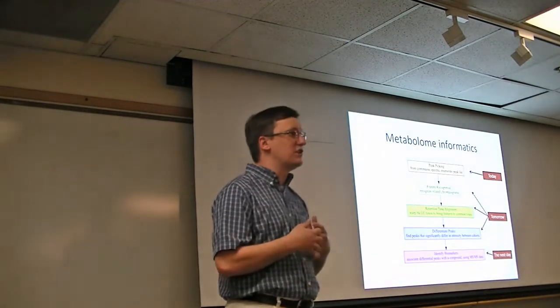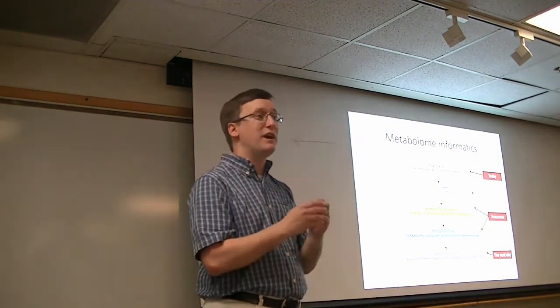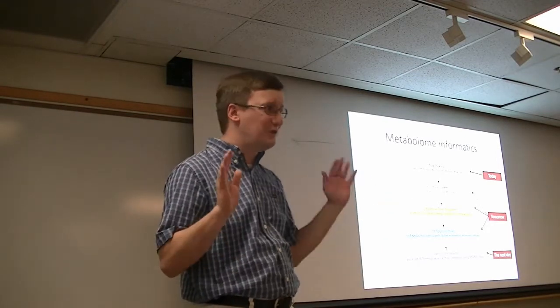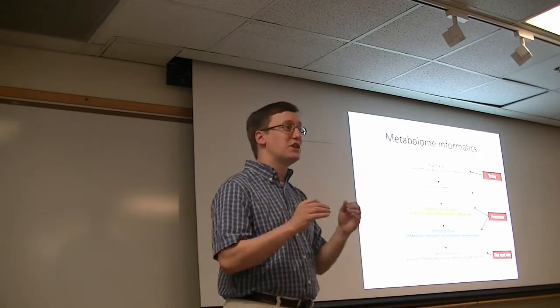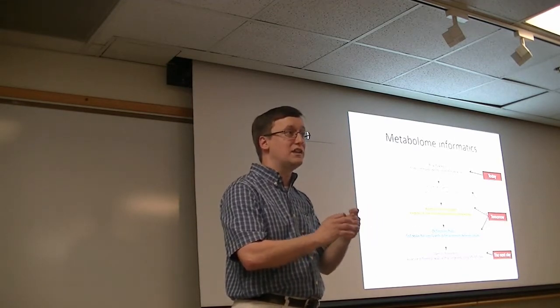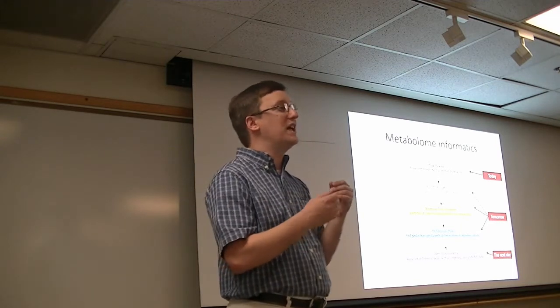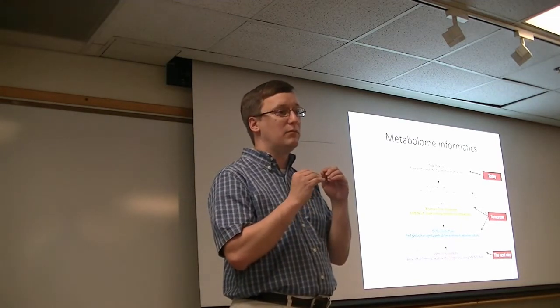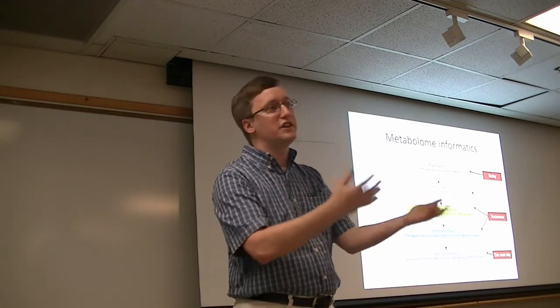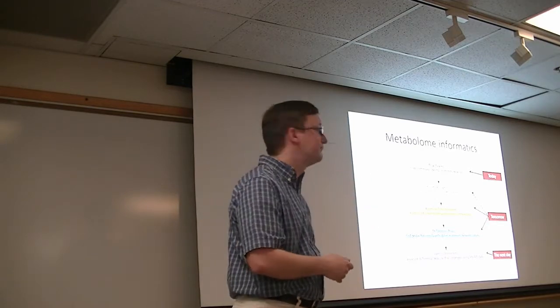Feature recognition here is the problem of recognizing related chromatograms. So perhaps you have different isotopes of the same ion. Treating each of those as an independent signal would be really foolish. So being able to recognize these associated chromatograms is important. And some of that can be rather experiment dependent. So you may have, for example, an adduct that is found along with the non-adducted form of an ion. So being able to recognize that these are associated is important.